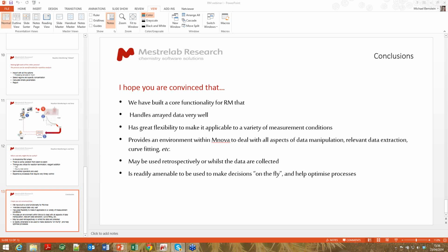Can they be randomly numbered? Yes, they can, because the timestamp is read actually from within AccuS rather than from the timestamp of the created directory. So I assume that would still work okay. I'm not entirely sure.